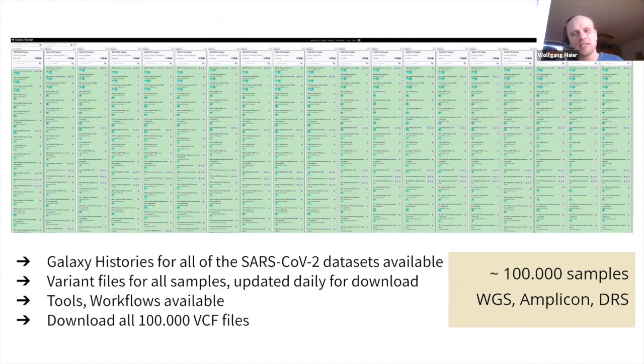So you can take batches of COG-UK data, for example, from a certain date, analyze all those together, or group it by technology, whatever you like. These are turned then into these 100,000 VCF files, regularly updated. And the question is, of course, how to provide all this information to the community. Next slide, please.